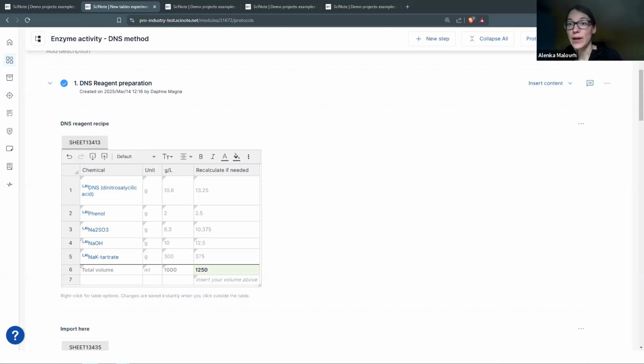What I would want to add maybe is that we are still trying to work and improve certain aspects of the reports that are not yet ideal. We managed to support one portion of the formatting that you can create in current new tables and well plates to maintain when you create the reports, but there is a portion of it that we are still working on and that is not yet ideally behaving.